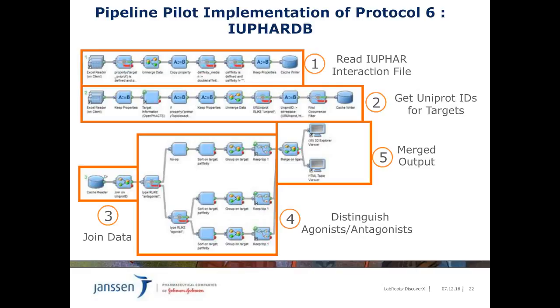Step 2 gets for each annotated target the UniProt ID of the target using the target information call. Step 3 does then the joining based on the UniProt ID. The following steps are generating the output format. The result is a list of compounds with linked targets which can be tested in the phenotypic screen.